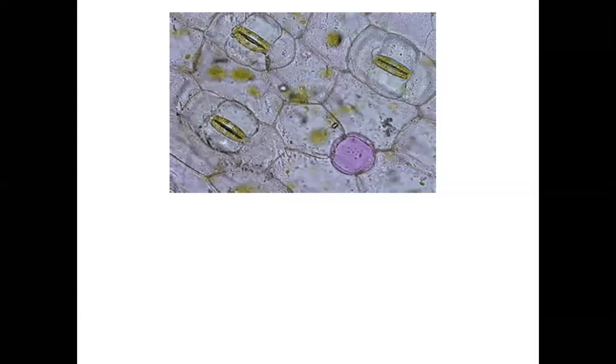It's very easy to make a slide and observe stomata. Sometimes you do so with students and you realize that some are struggling even to identify the stomata. These ones. Meaning this is a guard cell, this is another guard cell, then at the center there is the stomata.